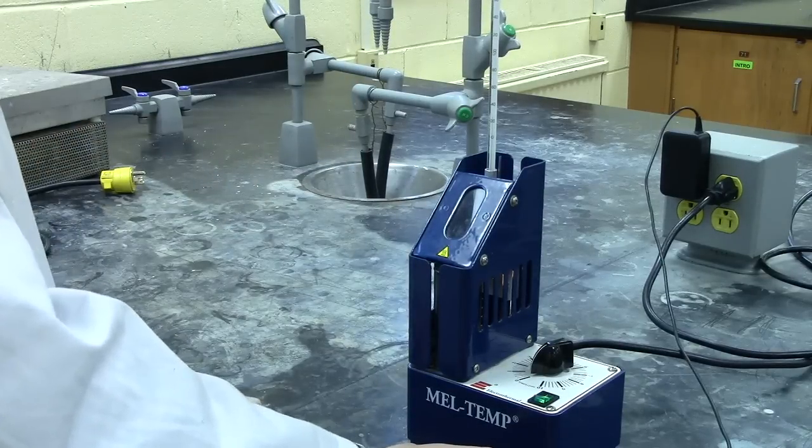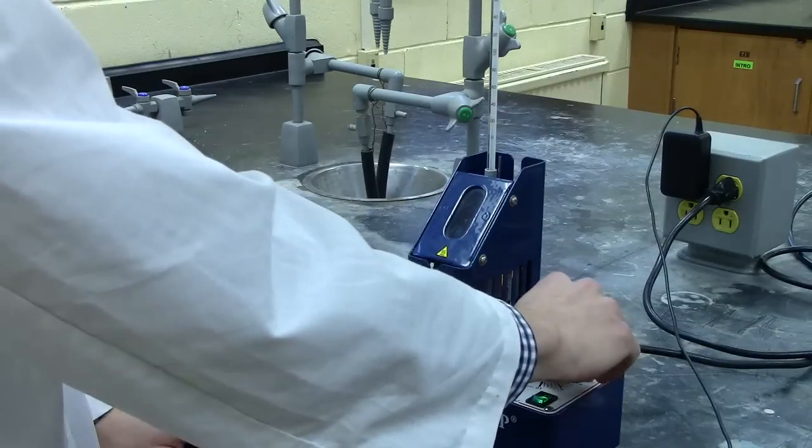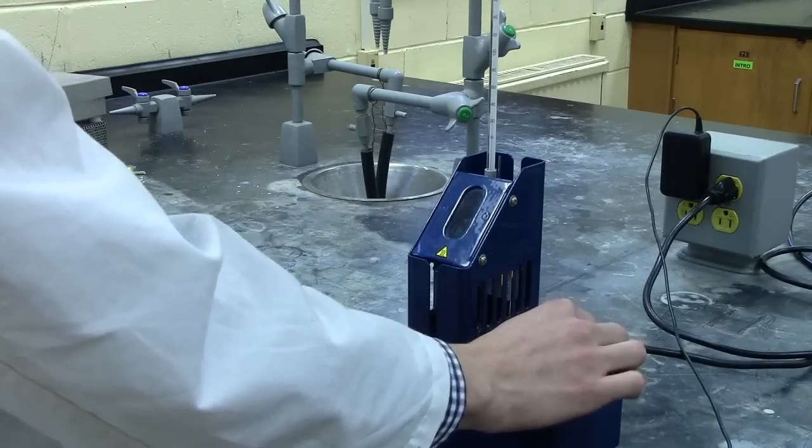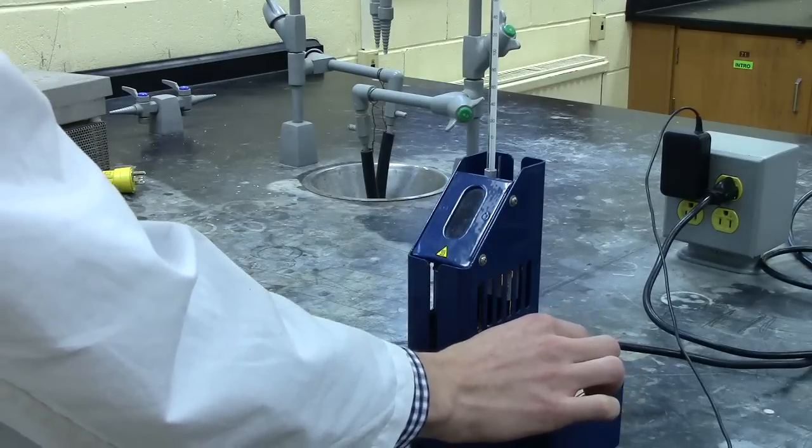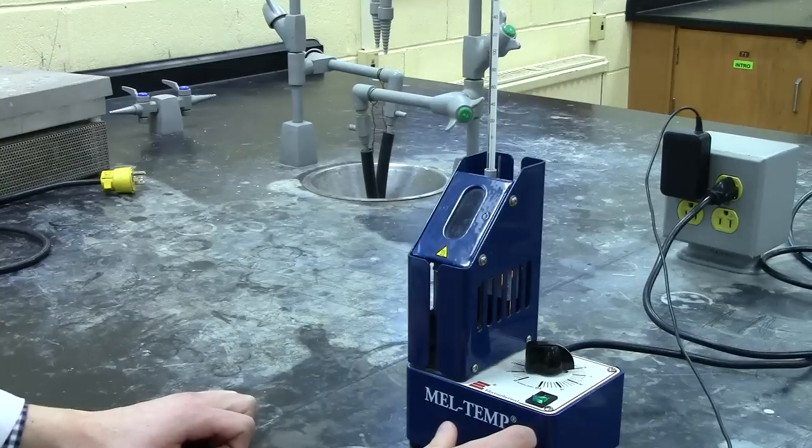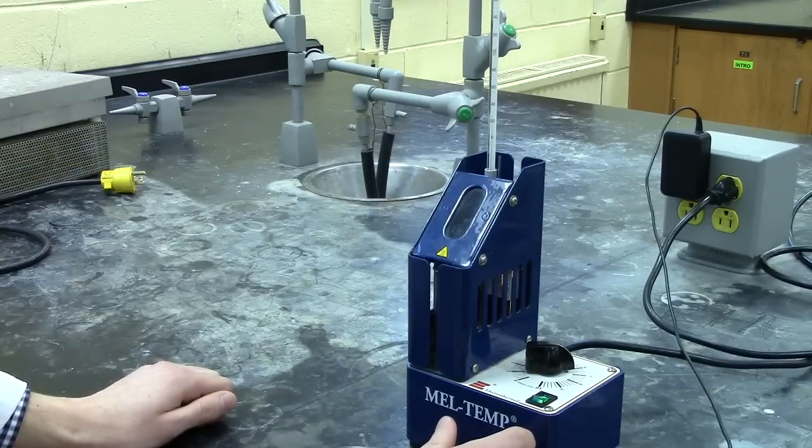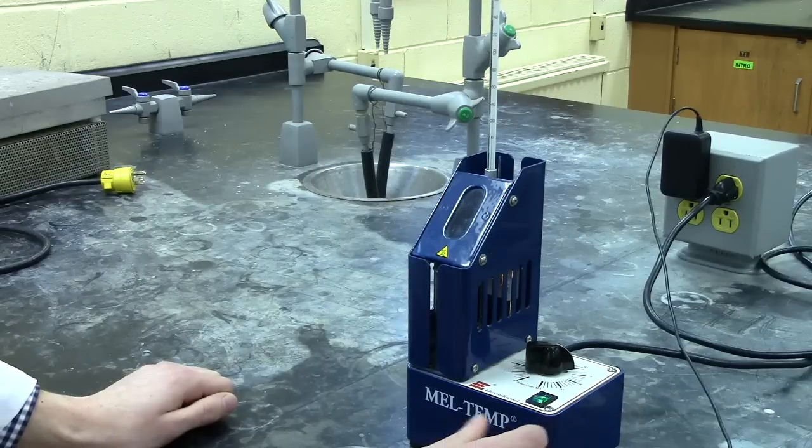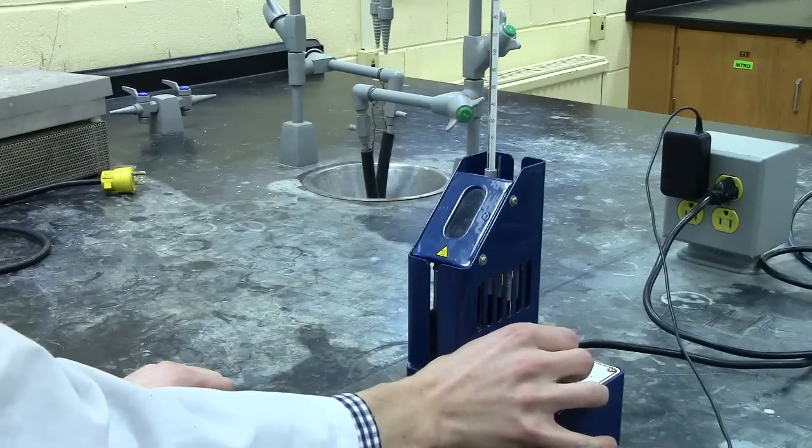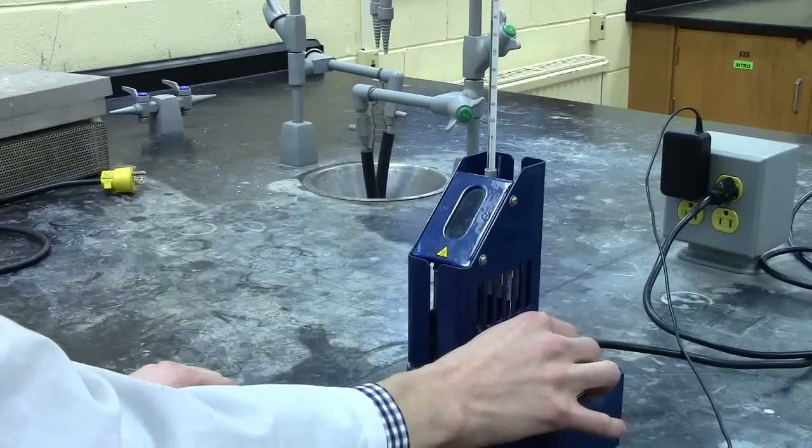To begin, if you have an idea of what the melt temperature or the range of temperatures you're expecting, you can turn the power level, which determines how quick the temperature increases, to roughly six or seven. By watching the temperature on your thermometer, once you approach your melt temperature or the range of melt temperatures you're expecting, you may want to decrease the rate of change based on the power level to between three or four.